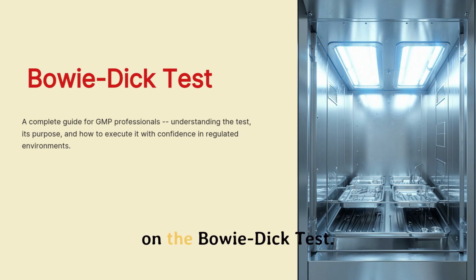Welcome to our session on the Bowie Dick Test. This guide is essential for good manufacturing practice professionals to understand the test's purpose and execution in regulated environments.